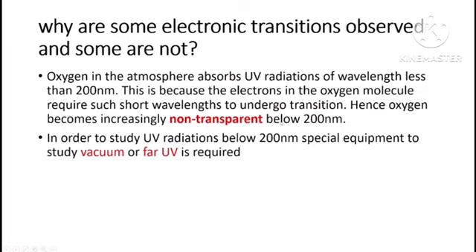So when you are working in an environment where there is definitely air, you need to critically look at the kind of wavelength you are working with. So far as it is below 200 nanometers, you wouldn't be able to get accurate results. And when you work with such results, you end up making wrong conclusions and giving wrong suggestions.